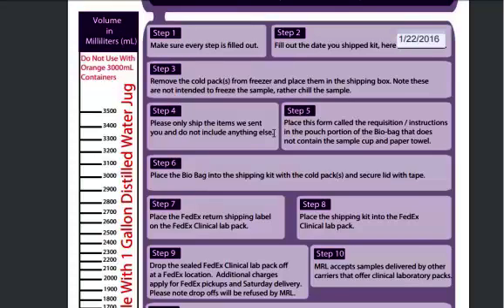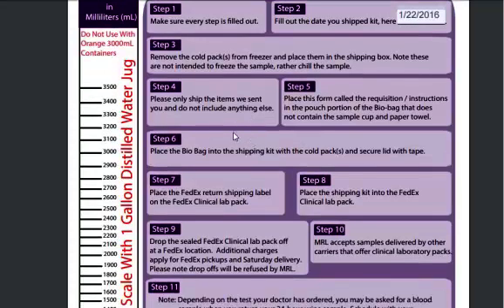Our kits are IATA approved. What's in the kits is what you need to ship in the kits. That's it, nothing else. Matter of fact, if you do ship something else, usually we send out a warning to let you know. But if you do it a couple times, we're definitely not going to do the test for you anymore. We're done. We're moving on because we value these shippers that are shipping us.